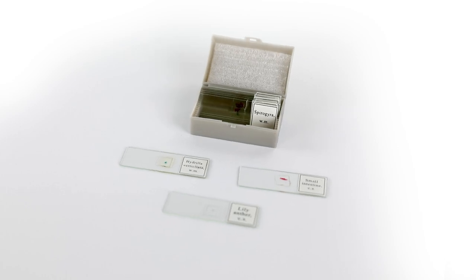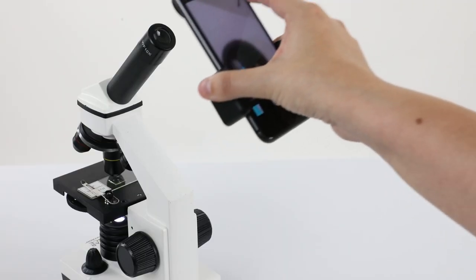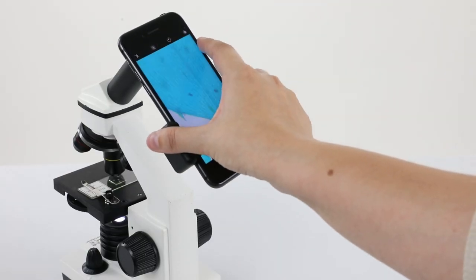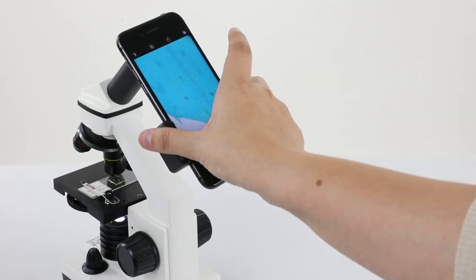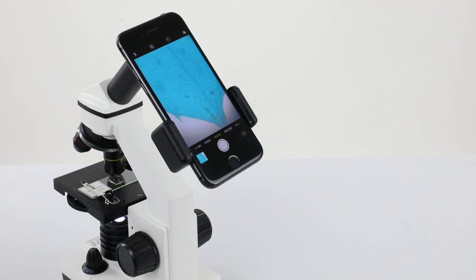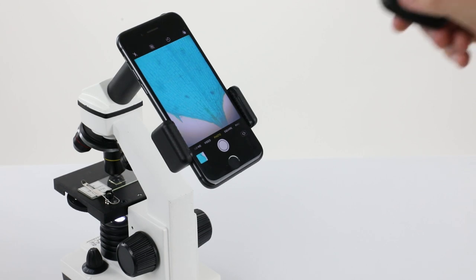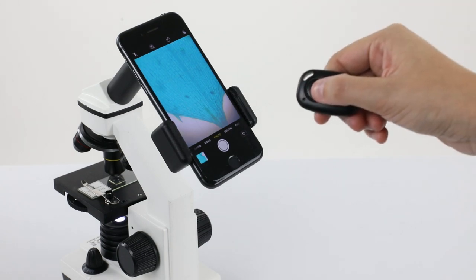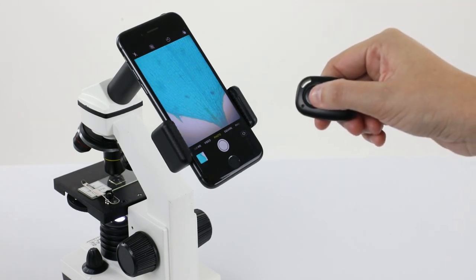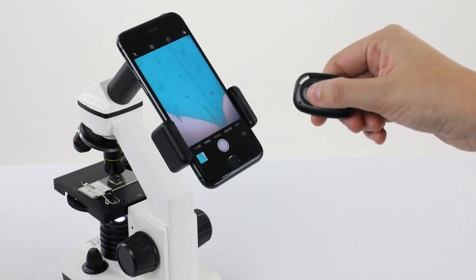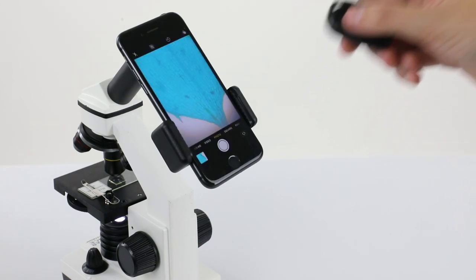This kit even includes a smartphone adapter so you can capture high-quality images and video through the eyepiece, and a hands-free Bluetooth shutter release for a steady shot.